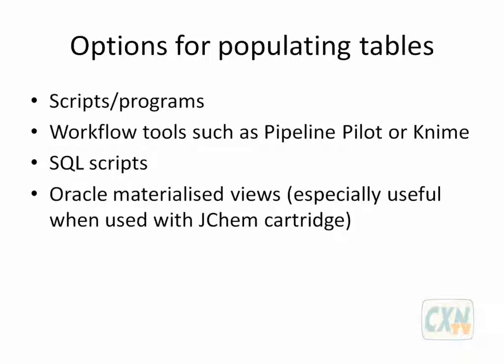Well, one thing I use quite often myself is just to use simple scripts or programs written in Java or other languages that can easily just process, let's say, some files and load them into the database. That's really quite an easy and a very suitable way of loading data in externally. Alternatively, you could do the same thing with workflow tools such as Pipeline Pilot or KNIME if you have access to those. Again, that's a very good way of loading data in.